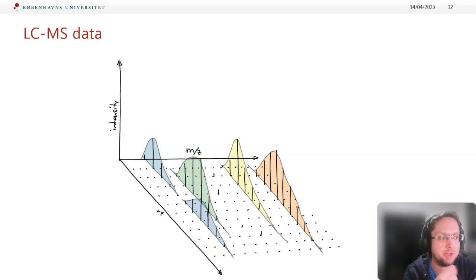That means a peak in retention time dimension. So where do these chromatographic peaks come from? They appear because the compounds do not elute instantly from the column. The compounds elute gradually. If, for example, we again look at a small section of our data and follow the green peak, we can see that the compound started eluting, the intensity increased, and then decreased again. A chromatographic peak is constructed by joining the same mass between consecutive scans.